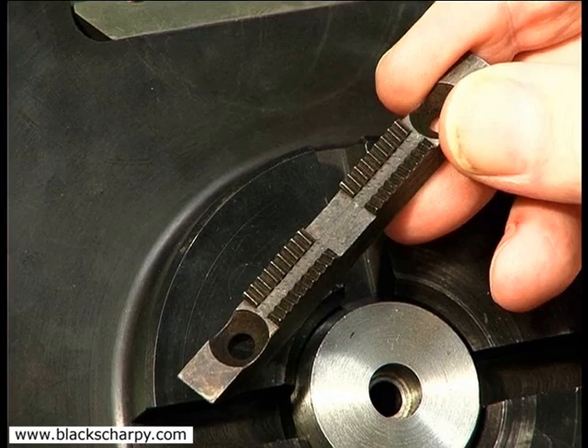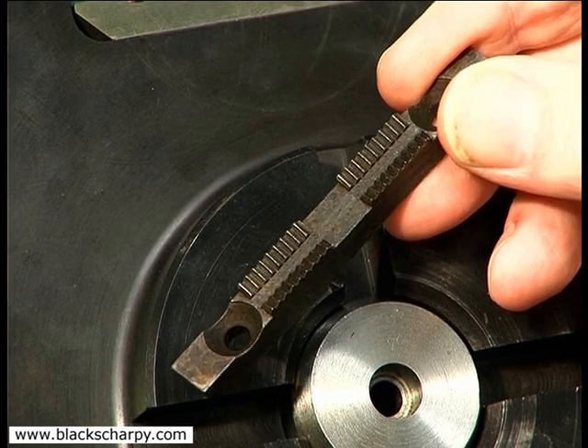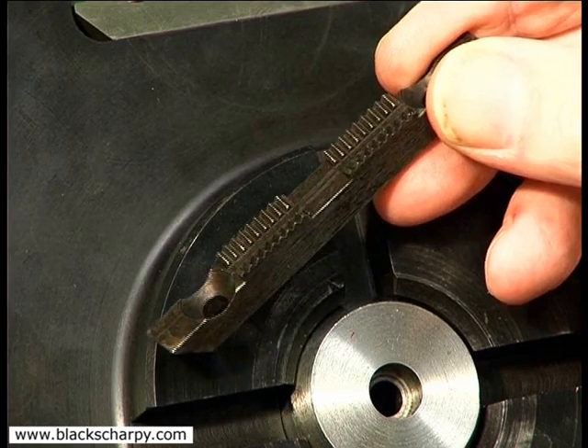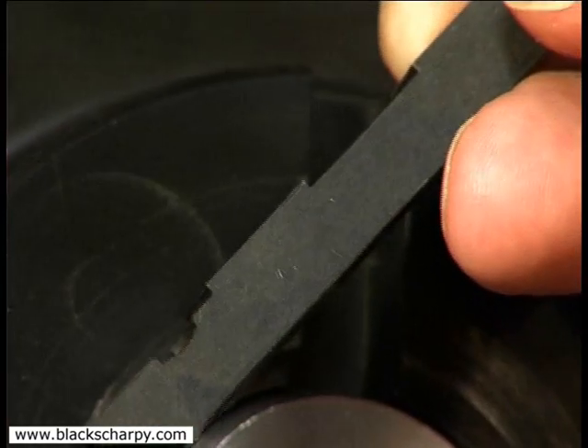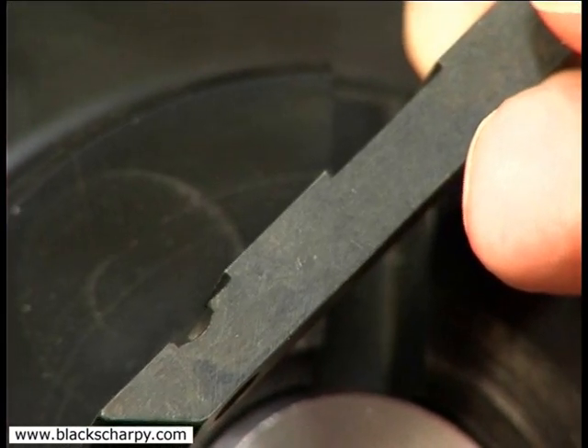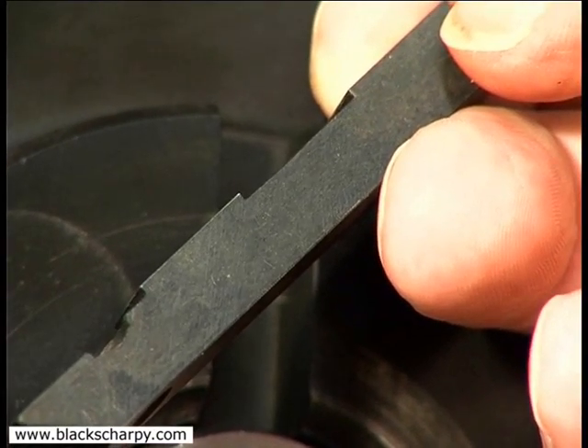For the clamping of round and tube specimens, serrated V-notch anvils are available for machining the first and second cuts. The third and fourth cuts use the flat clamp and flat anvil, as you clamp on the flat faces already machined in the first and second cut operations.